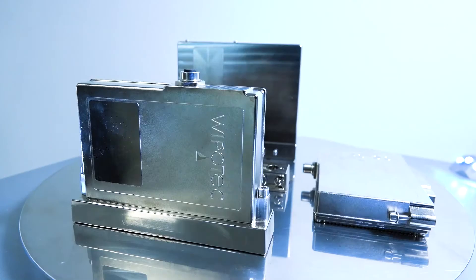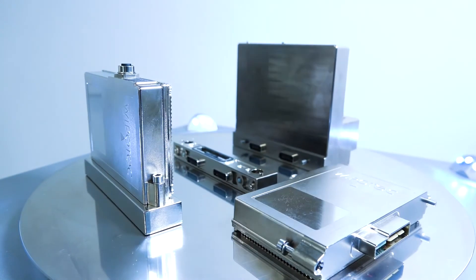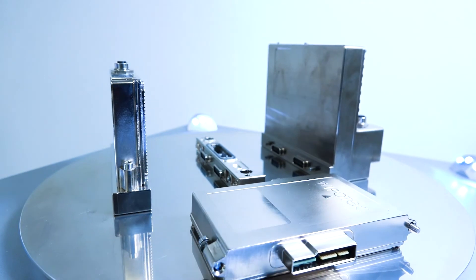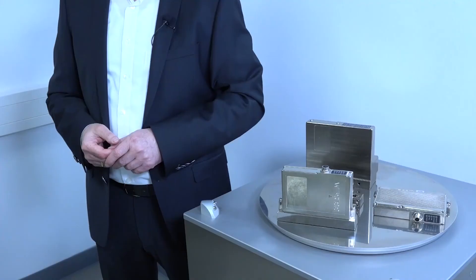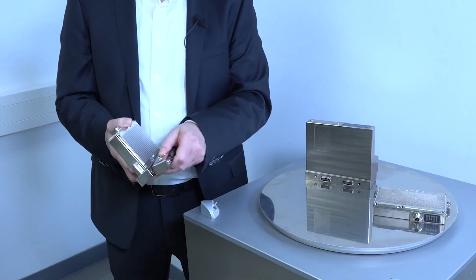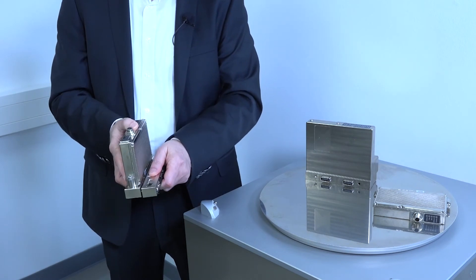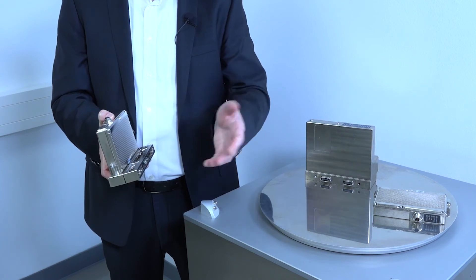This is our new modular multi-lane system, MMS 2. The new system is about 50% smaller compared to the very well-accepted previous solution, and thanks to an IP65 rating, there is no need to mount it in a cabinet. Single track modules are mounted together like a valve cluster, and the number of single track modules depends on your application.